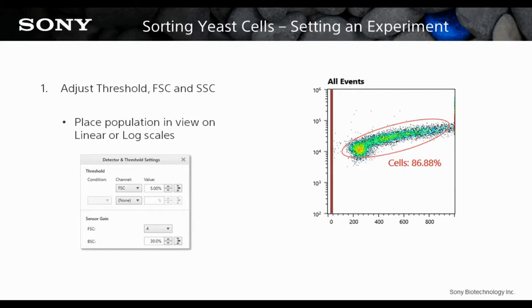Very often, new users have a hard time identifying where the cell population is in the scatter gate. This is because each instrument software may look different and have different threshold and scatter default settings. However, with experience, you realize that, in fact, all flow cytometers detect cells using the same principles and should have the same 3 main settings. Let's briefly go through them.